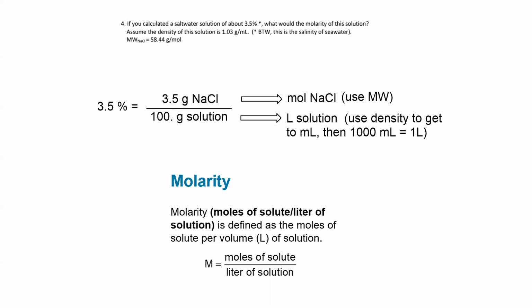If we do that, we'll be in the correct units for molarity. So we can report that number, whatever it is, and the unit will be capital M, which stands for molarity. It could be like 1.0 molar, for example. That's how we would write that: 1.0, and the unit would be capital M. So that's what we're trying to do for the post lab.